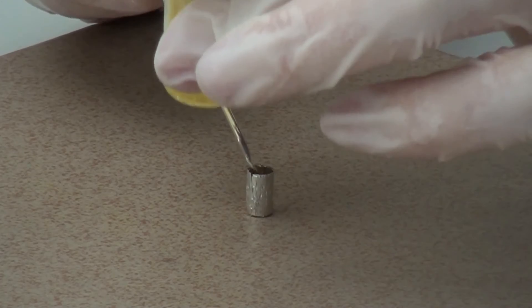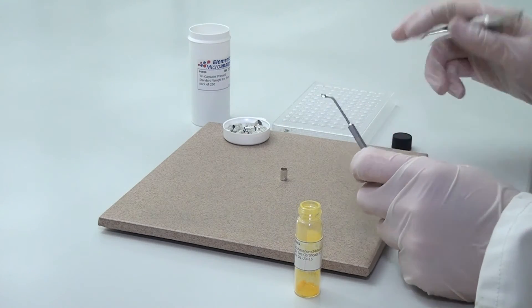The ones with the curved spoon are particularly convenient and these come in both left and right-handed versions.